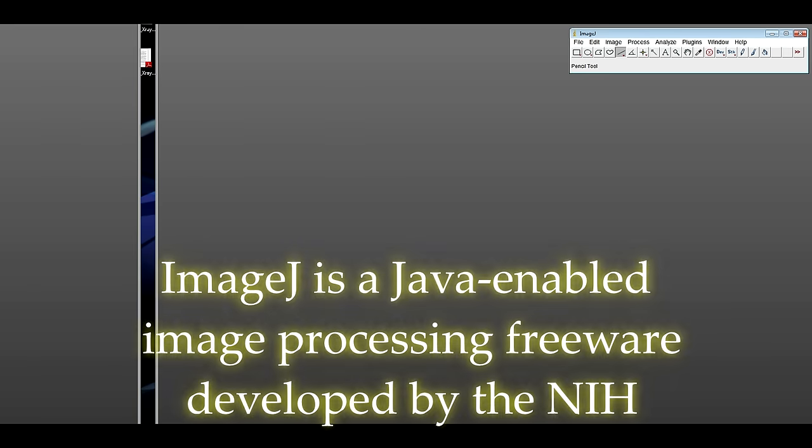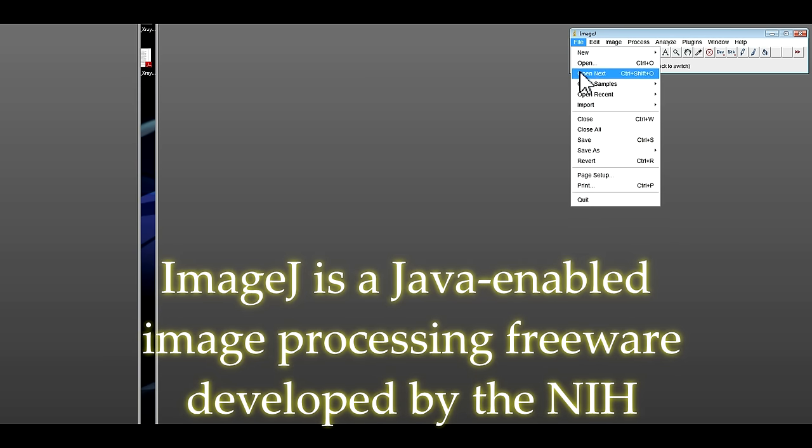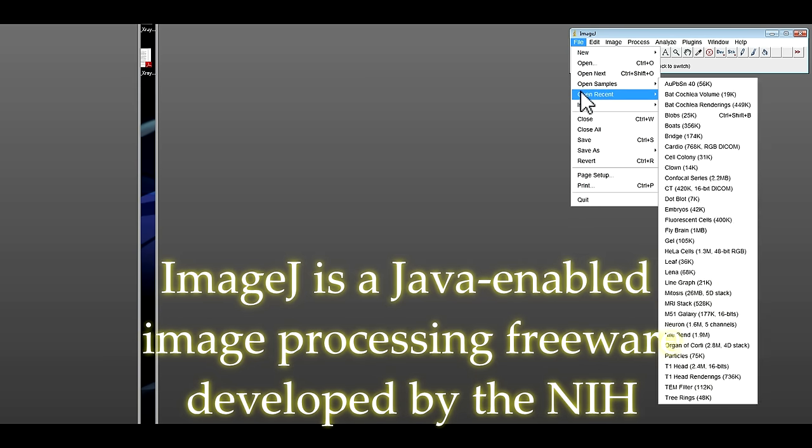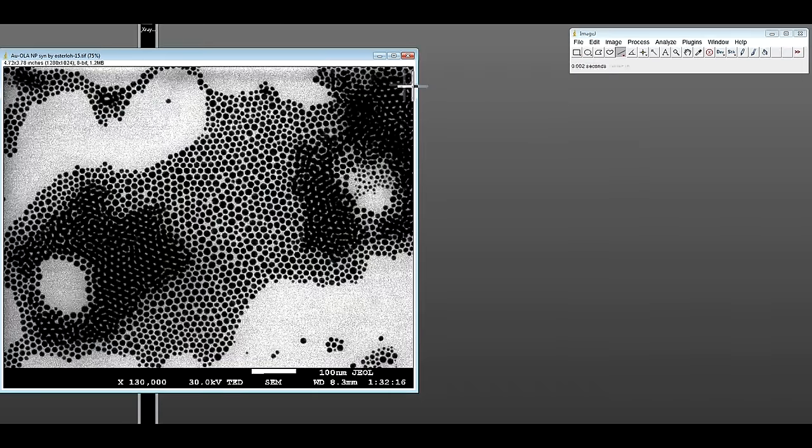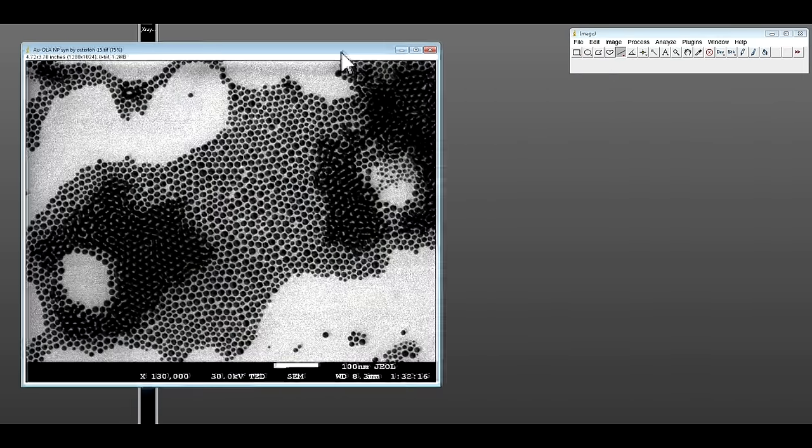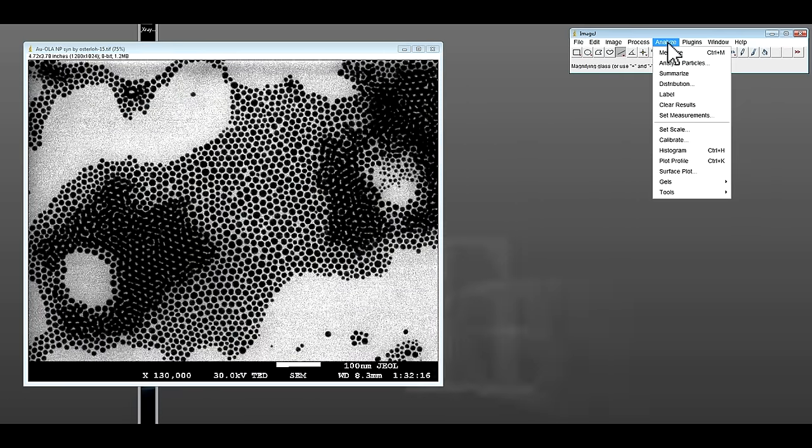Open image A, open the interested image, then calibrate.